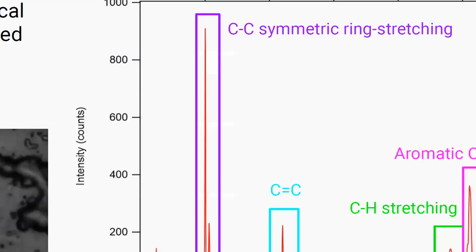Part of what we've started with is just looking at the different sources of microplastics. We're doing that by putting microplastics into our seawater aerosol generation tank. We've started just with the Raman for looking at this, but you can see here that we are able to identify microplastics out of a whole sea of other particles that are primarily salts coming out of the seawater from our marine aerosol reference tank. And these showed up quite nicely.